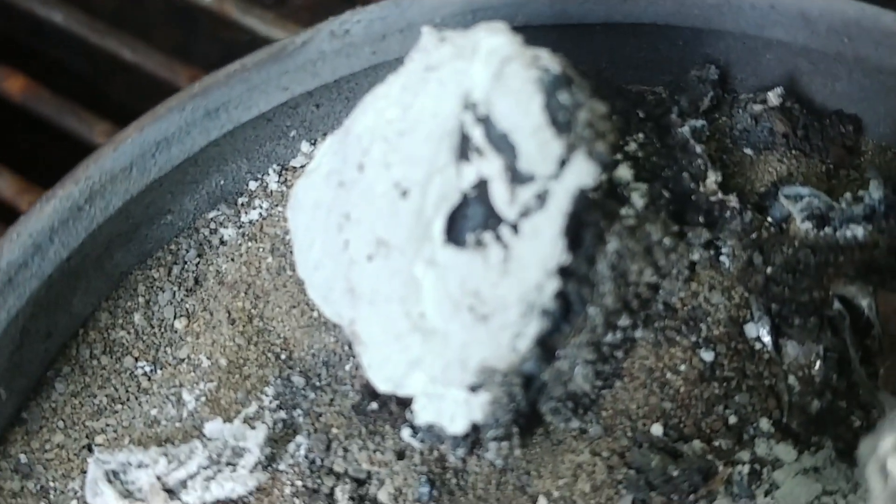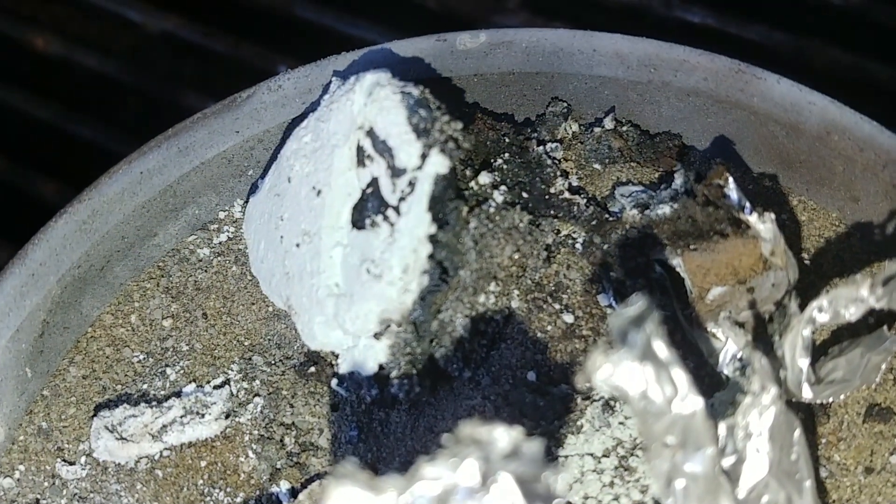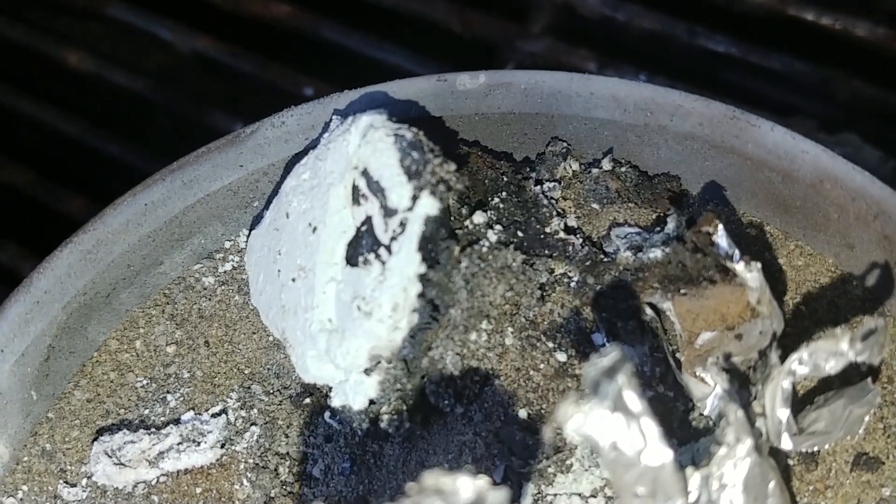The iron looks a little bit blue — I could see that happened yesterday, and I thought maybe I mislabeled one of my bottles with the sapphire mix. I'm gonna try to focus on that. Well, focus doesn't work. I don't even think you can pick that up, not even with the light. Maybe — I don't know, it looks a little blue, but it's ruby mix so it should be red.